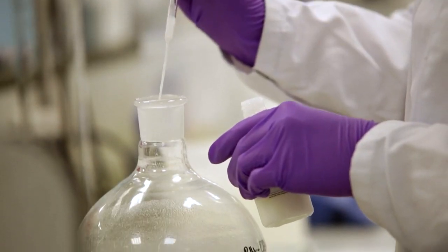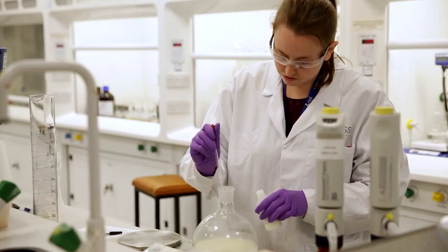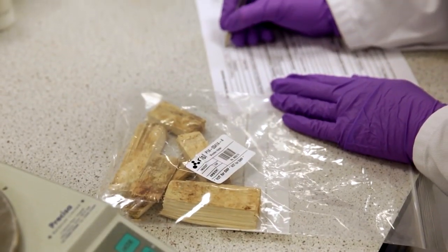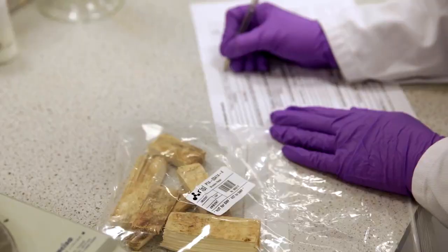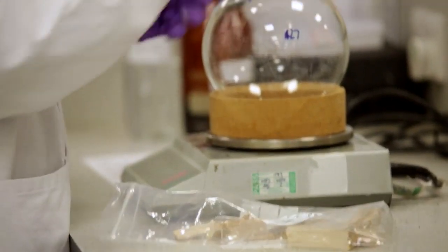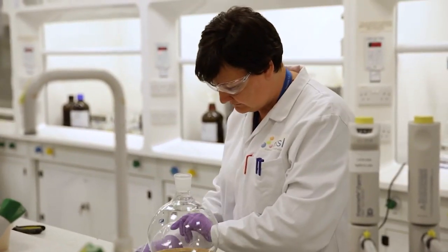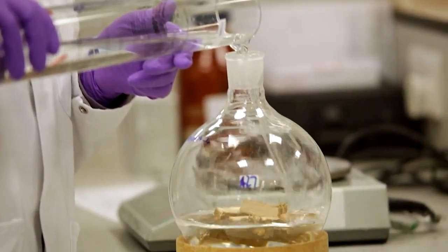The results of analysis confirm the same chlorophenol pattern seen in the tainted cake sample. We identified the likely source of the taint as being the pallets used to ship and store the flour. This was further supported by the fact that our customer discovered that the pallets were cleaned with chlorinated chemicals.